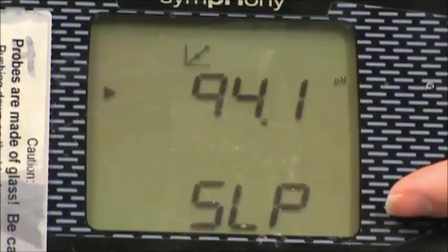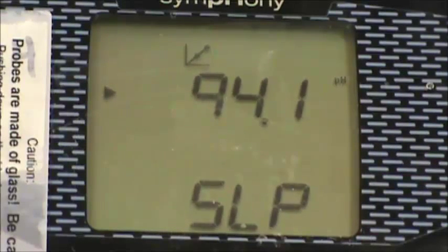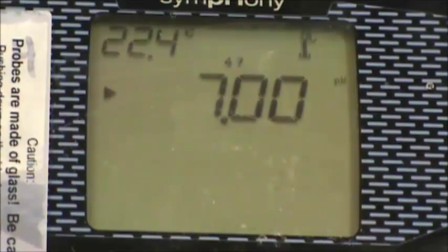SLP will appear on the screen momentarily and be replaced by the main analysis screen showing the pH of your current solution. The two values of your calibration standards should be shown above the reading and the measurement icon should be shown in the top right-hand corner of the screen.